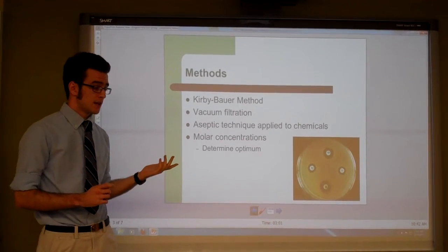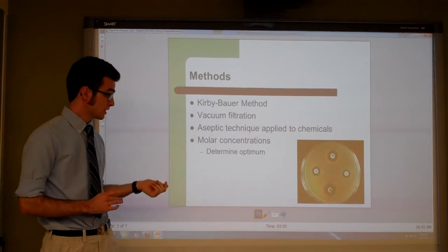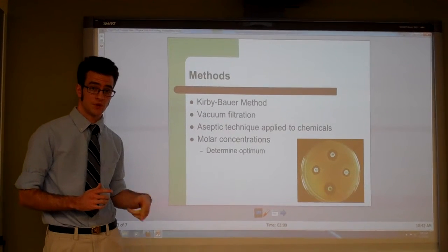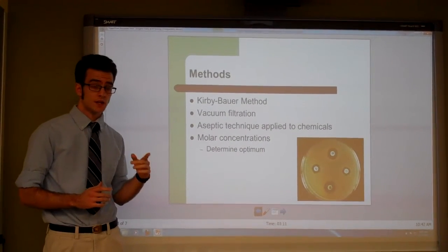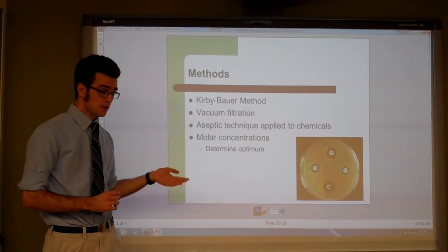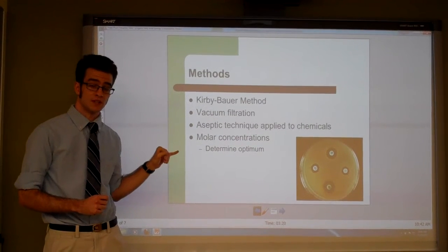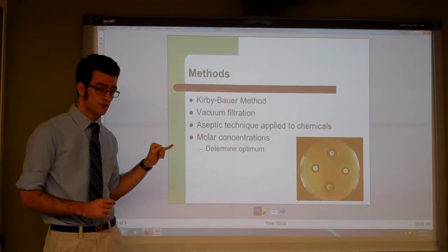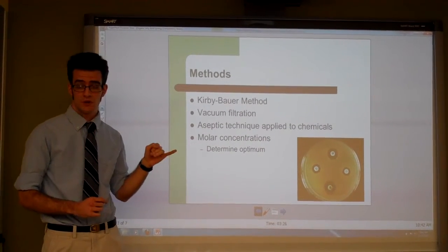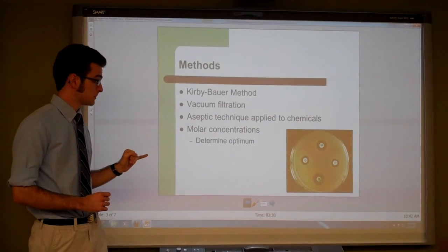Now, some problems arise with using organic fatty acids in that they are really, really sensitive, structurally speaking, and sterilizing them was at first a problem. However, I found that I could vacuum sterilize these by filtering them through very fine filters to make sure that they do not contaminate the plates I'm applying them to. And as stated here, this falls under the purview of aseptic technique, which is very important when you're working with bacteria, because if you want to get pure results, you have to make sure that there are no contaminations to your culture plates at all.